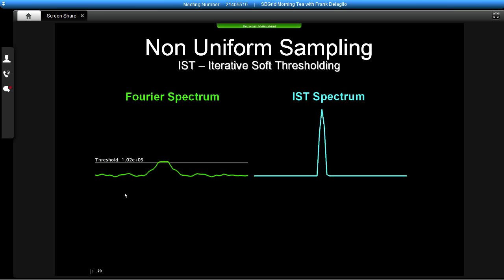animation, whenever we stop this series of iterations, we can take whatever is left over in the original Fourier data and add it into our accumulated spectrum so that in practice, no signal ever gets left behind in this iteration.